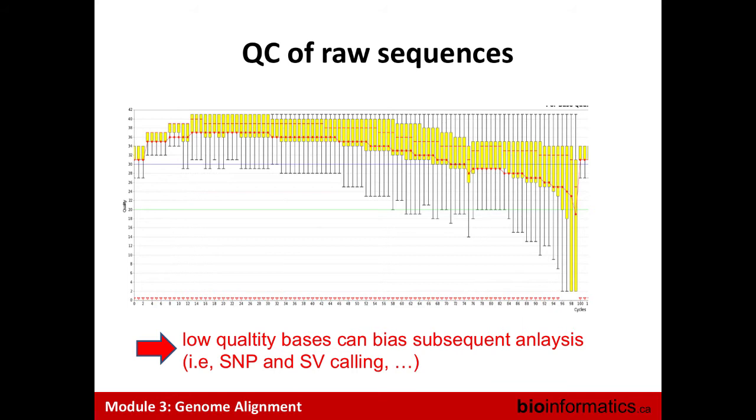So when the image of the flow cell is read by the sequencer, it will say, oh, it's yellow, but not a pure yellow, because other bases start to pop up with other colors in the pool of sequences in your cluster.